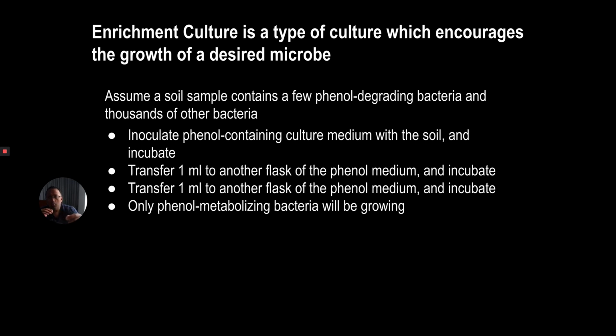And then what I'm going to do is transfer. So I wait a while, the bacteria grow, then I transfer 1 ml from that original culture to a new culture, right? And that 1 ml will probably contain some phenol-eating bacteria. And in this new culture, I feed it more phenol. Again, I'm not stopping anybody from living, but I'm also not feeding them, right? And so then I do this process a few times, and after a few times, the only bacteria that will remain when I take something out will be bacteria that eat phenol.